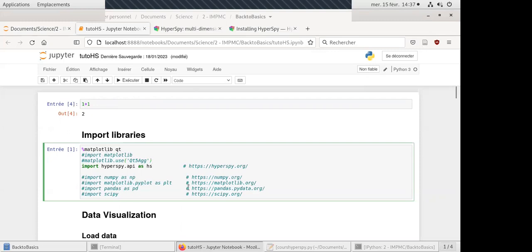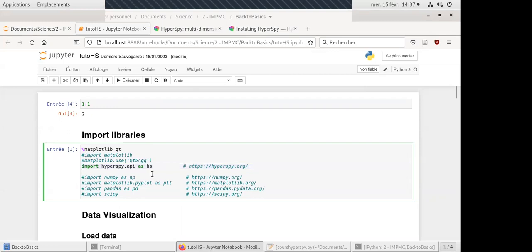First, I've imported a lot of libraries — I commented them out just to show you the basics. The one which is useful here is HyperSpy. HyperSpy is a set of scripts giving you access to tools to process hyperspectral data. You import the library and give it a short name like 'hs' so you don't have to type the full name each time. Other useful libraries are NumPy, which lets you work on arrays.